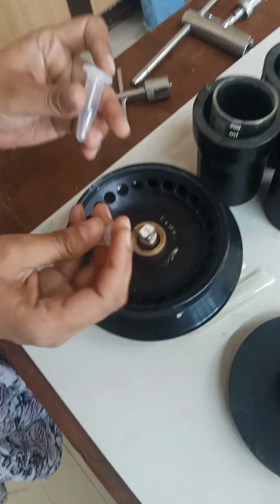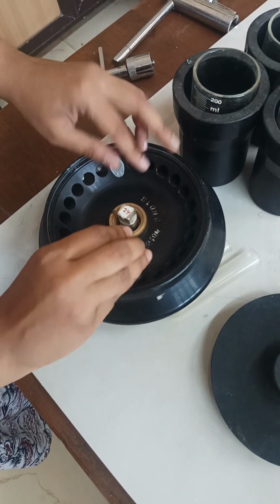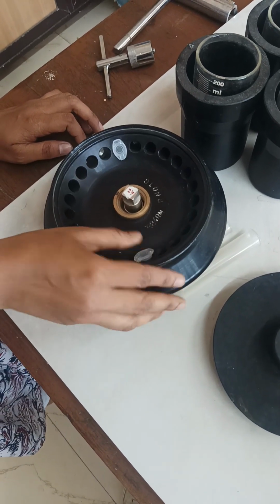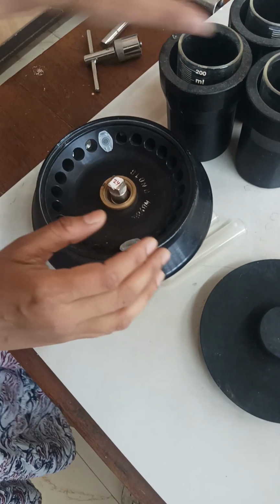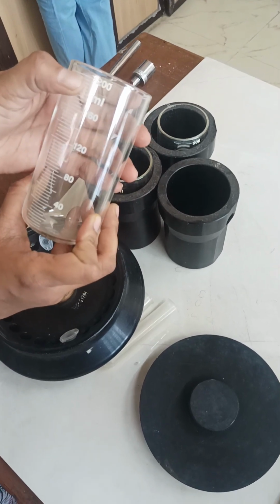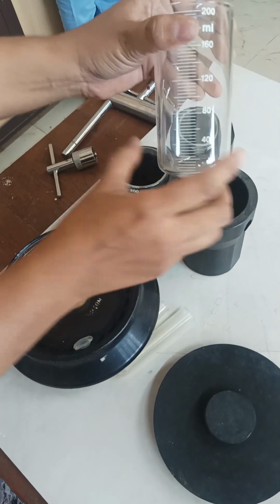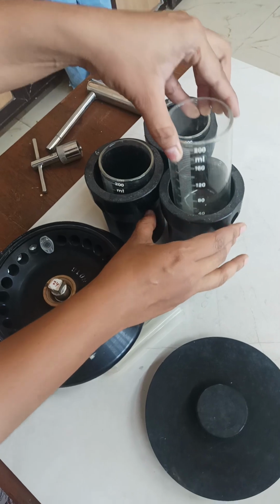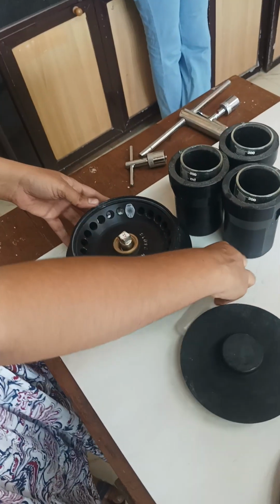The same rule applies here. You have to balance with equal volumes of sample, with 2, 4, 6 tubes, placed in front of each other. That is the same rule for operation of this. Now these are the rotor type of tubes having a capacity of 200 ml. If you have a larger sample size, then you can go with the swinging bucket type of rotor. These rotors have these kinds of tubes, and you can put them in and use this as a swinging bucket type.